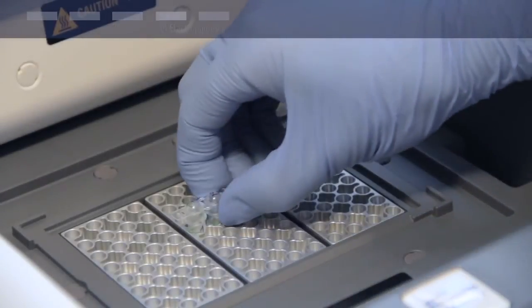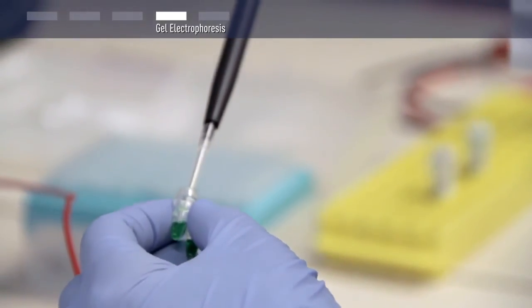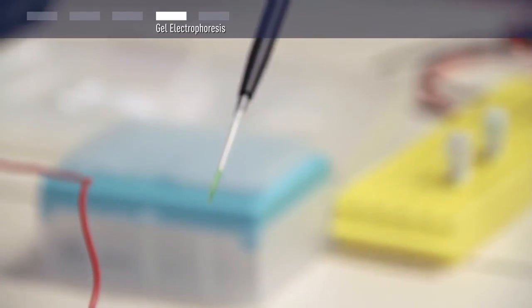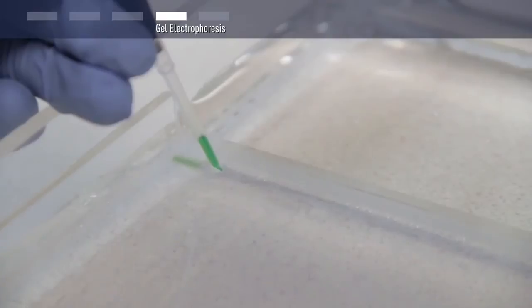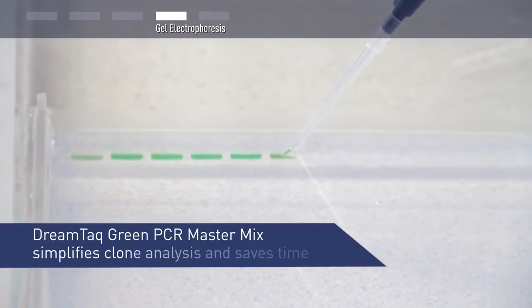After PCR, analyze products by gel electrophoresis. To do that, simply load 5 to 15 microliters of your PCR mixture directly on a gel. When working with DreamTaq Green PCR Master Mix, it is not necessary to add loading dye into the reaction mixture prior to electrophoresis. This simplifies clone analysis and saves time.